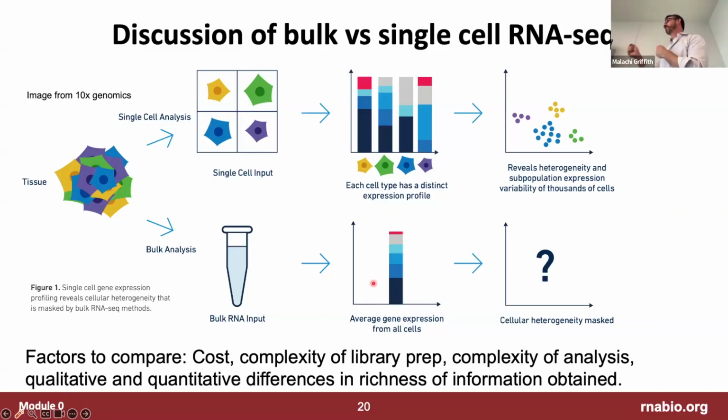But it's hard to isolate the blueberry and the pineapple essence of the smoothie after they've all been mixed together. There was a whole subfield of bioinformatics going on for years where they would take bulk transcriptome output and try to deconvolute it. So there's various deconvolution tools that will try to say, okay, what if I make certain assumptions or guesses, and then I refine from that point and try to separate out the signal into different piles. That's possible, but really hard to do well and has fundamental limitations.